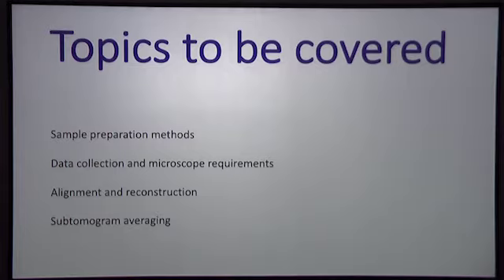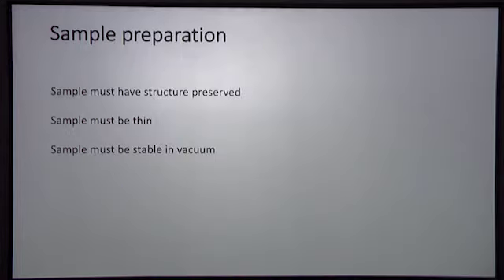So I'm going to talk at least briefly about all of these things: about sample preparation methods, about data collection and microscope requirements, about alignment and reconstruction, and about subtomogram averaging. So let's start with sample preparation. What are the requirements?